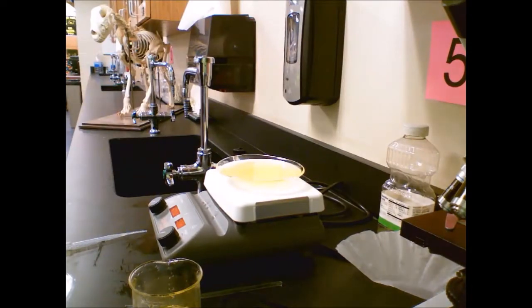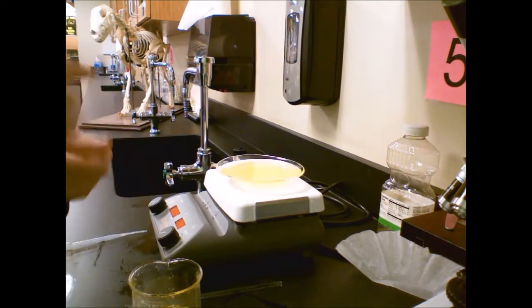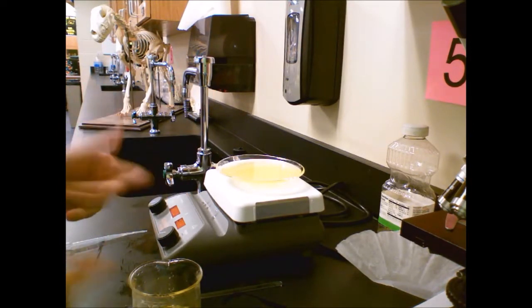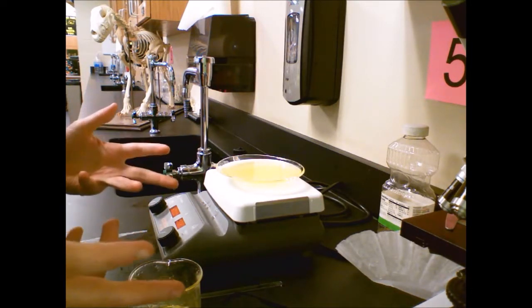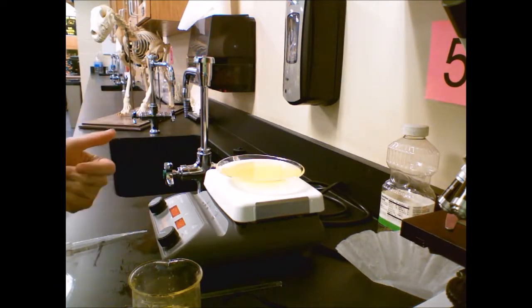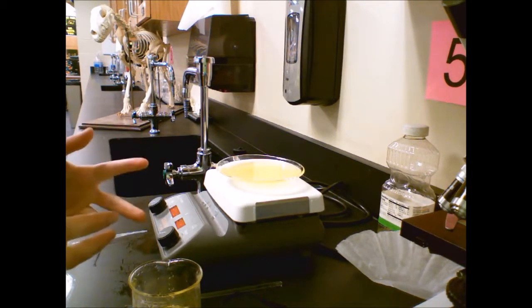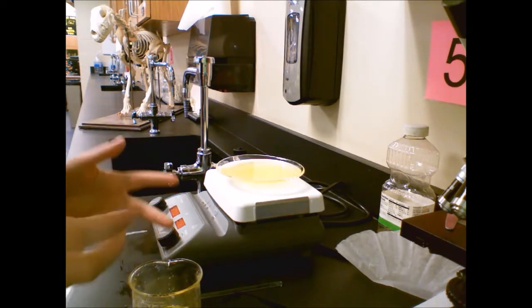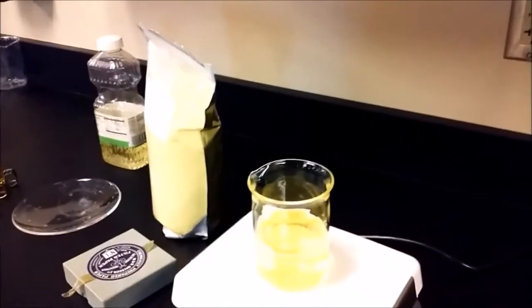Unfortunately, there's no hard data on that. Given the fact that canola oil only has to be a precise substance within a wide margin, relative to something that's laboratory grade, there's not going to be anything printed on the solubility of sulfur in canola oil, and I certainly couldn't find anything. So there was a long experimental process involved in trying to figure out exactly how to get those beautiful crystals. So we are going to see how this goes.